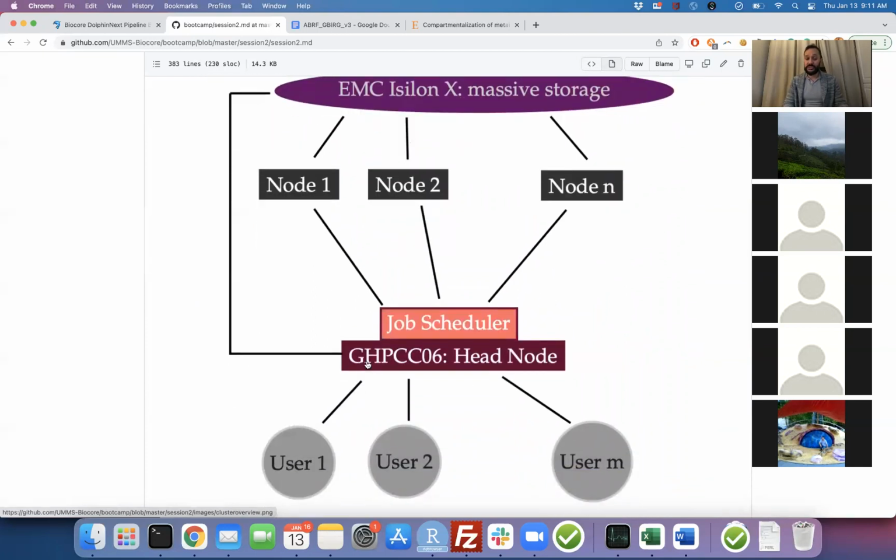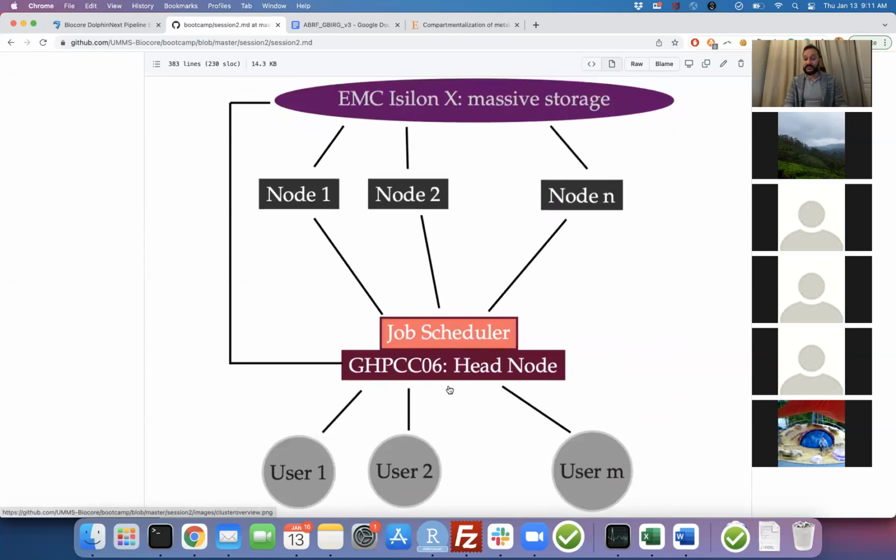And what you did before, last week, was you just connected to the head node, and what we did there was copy the files. That's all fine. You can do those kinds of things on the head node. But when you want to run a real command, like aligning the reads to a genome, it's going to take a couple of hours. If you want to quantify your reads on a transcriptome or genome, it's going to take maybe 8 hours, maybe a day sometimes, if your data is big. Or when you're running a single cell RNA-seq data analysis, sometimes it takes a week just to run.